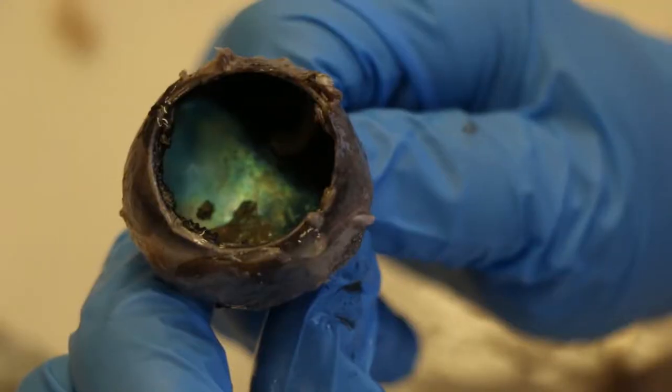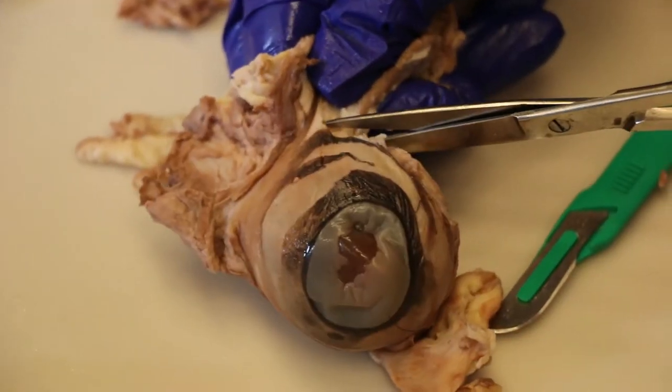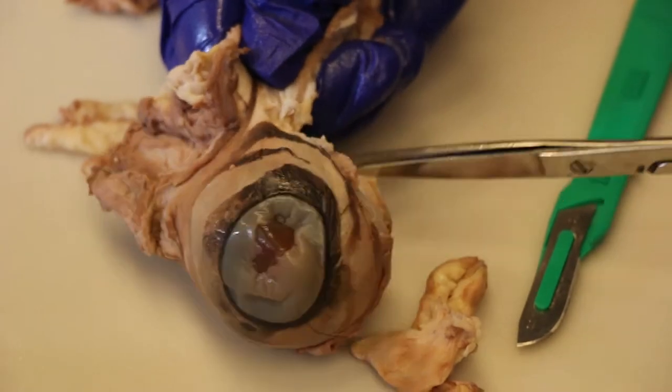I found a lens. There's also this sort of background color — I don't know if you can see it. Basically, it helps the animals with night vision, and that's why their eyes glow green at night.